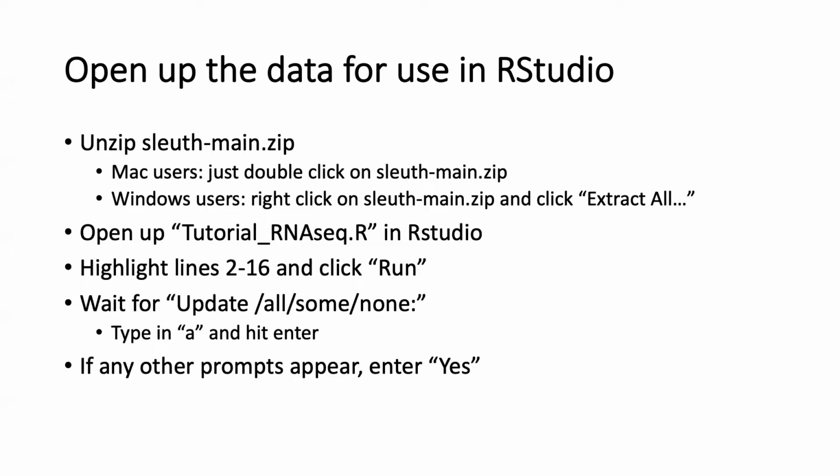If it gives you a prompt that says update all, some, or none, go ahead and type A to update all and hit enter. And then if it gives you any prompts that need a yes, go ahead and give it a yes and hit enter as well.